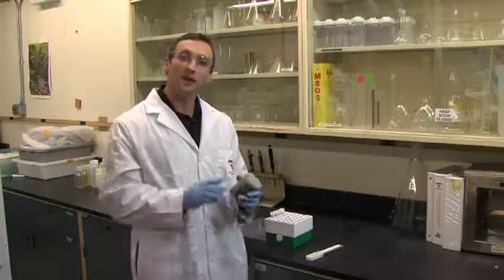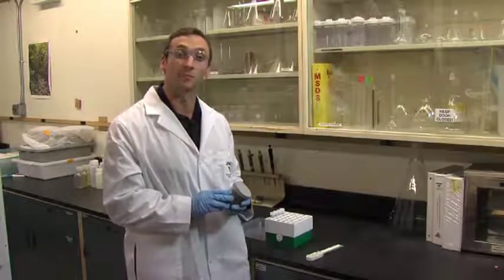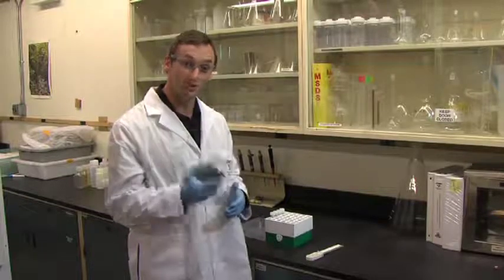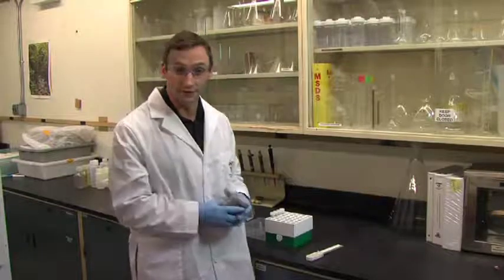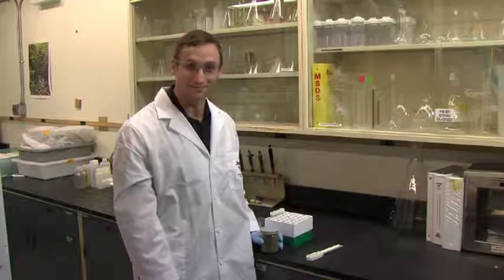If the chemist just scoops the soil from the top of the jar, it may not be representative of the sampling location site as a whole. In our case, we're interested in the concentrations of lead at our site for a soil of a particular grain size. Therefore, we sieved and homogenized the soil in the field. Since the grain size is the same throughout the sample, the lab does not have to homogenize the sample. If homogenization is not performed in the field, the project manager needs to review the laboratory's subsampling procedures to ensure the project needs can be met.